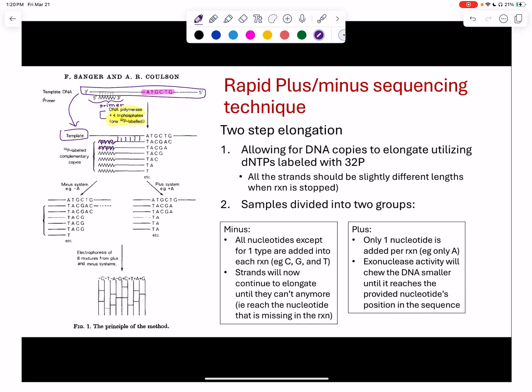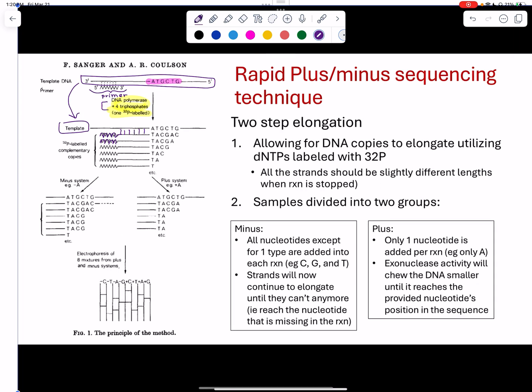In this sequence of interest, nucleotides are going to be added to this elongating strand, extending at a variety of different spots. So in theory, we are going to end up with new strands that are maybe full length. Maybe we'll get some that are stopping after this A, after this G, the C, the A, and the T.